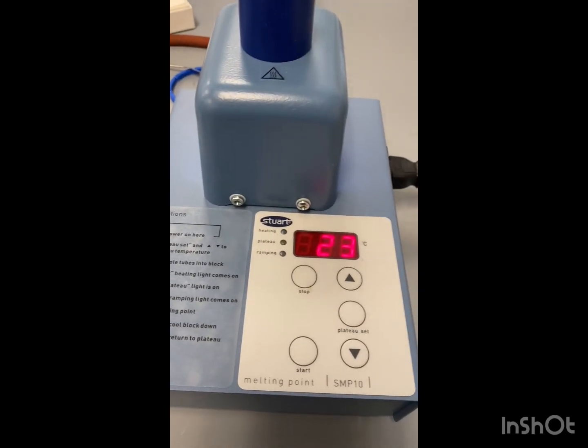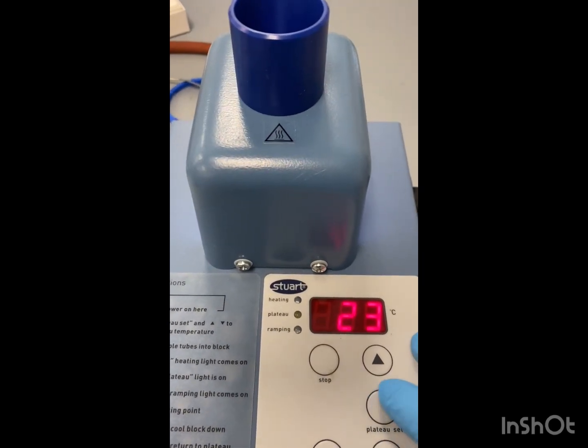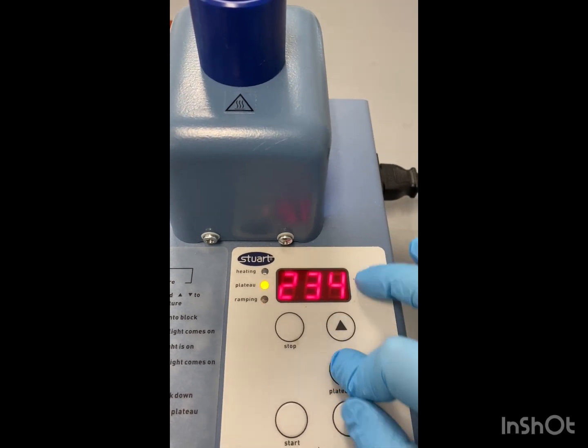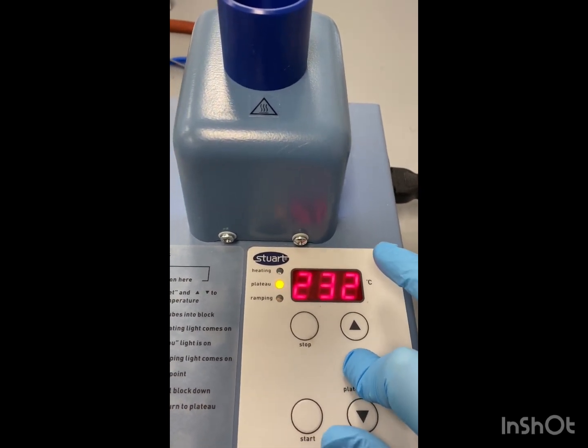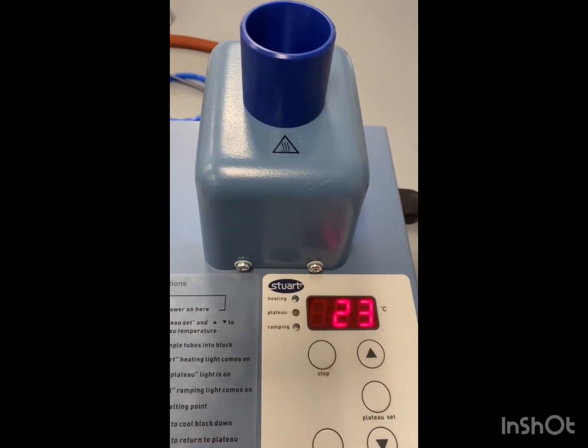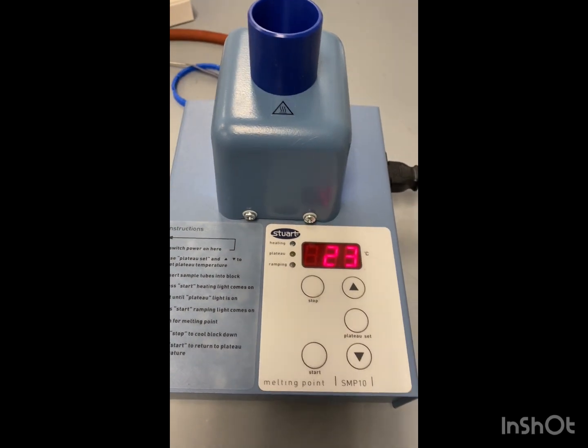All right, so since our range is around 236, we're going to plateau set. I went ahead and set it at 233, somewhere around there. You don't want to add the melting point range because we're going to ramp it and heat and watch it melt, hopefully around in that range.